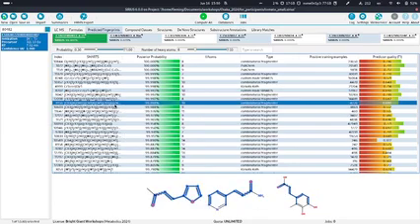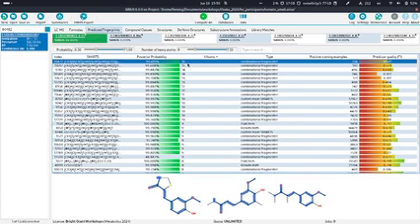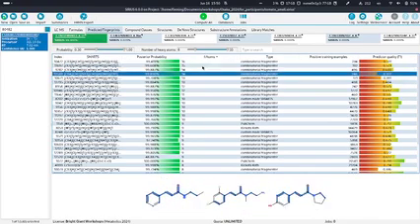So in general, I would always make a filter over the probability and then click on the atoms column, because this will sort the list based on the number of atoms. Then go from top to down, because then you see the substructures which are quite meaningful because they are large, so you can get some information from them. You can scroll down the list and look at the large substructures which are contained in your molecule with high probability. Especially if we go to the top ones, it will really give you some information on what we predict the structure should look like.